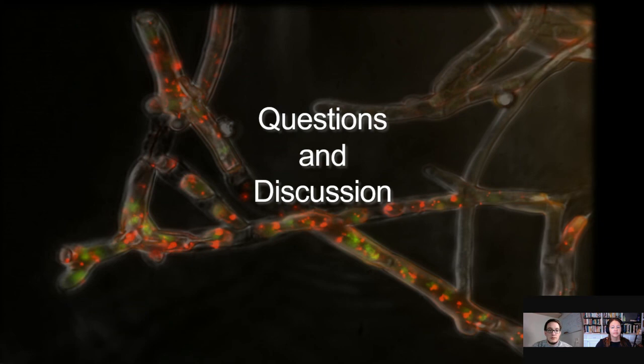Well, we didn't really look into off-target effects. Of course, we selected all our single guide RNA spacers, manually curated for avoiding off-target binding. But if that would be the case, for example, we can create off-target activation of lethal genes. In a very unfortunate case, then we would probably not get colonies. We could also create a repressor if the CRISPR activator binds on places where it should not, and again, in lethal places, we should not get colonies. But we didn't really take into account undesired off-target bindings with this system.